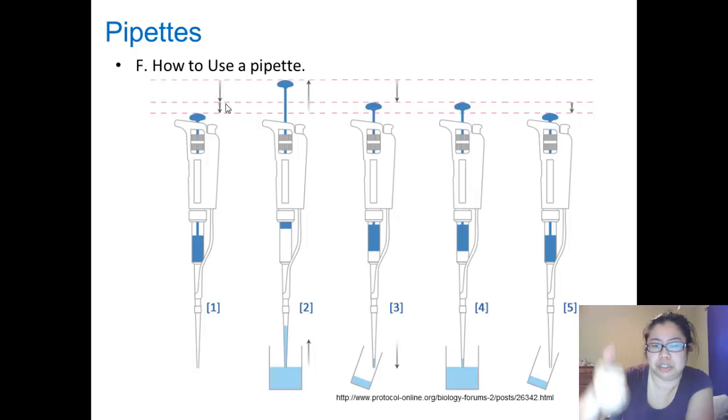Then you put it into the liquid that you need. Release slowly. And then you put it into the area where you want the liquid and press down to the first stop. And then press it even more to the second stop.